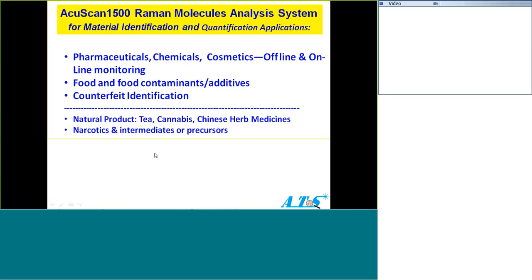Is it necessary to calibrate for the polymers of the bag? We can remove it. Our background can be removed in our software. It's not necessary. You will do it in the software. I'll show you in a minute. It's a software capability to remove the background from the trace, so you will see the active ingredients instead of the background.